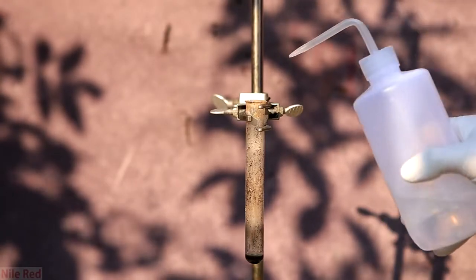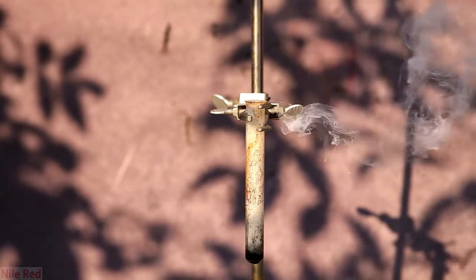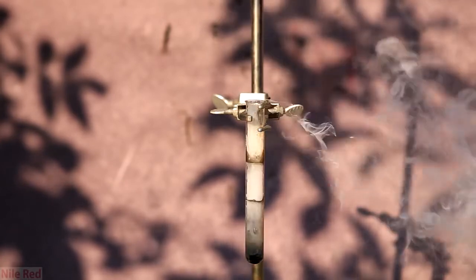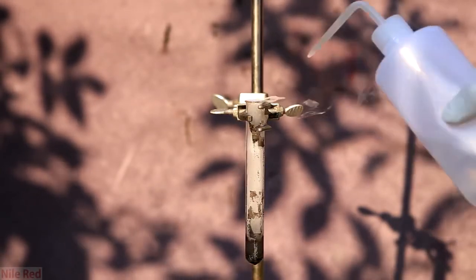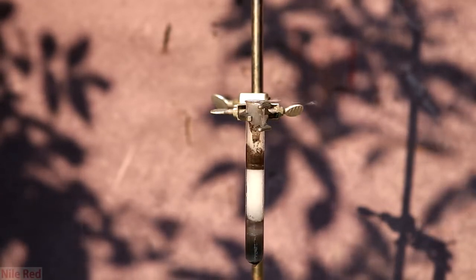When the reaction is done, a little bit of water is added to the test tube and you can see that it reacts pretty violently. This happens not only because the test tube is still hot, but it contains a lot of aluminum bromide which reacts exothermically with the water. Eventually enough water can be added to fully neutralize all the aluminum bromide and cool down the test tube.